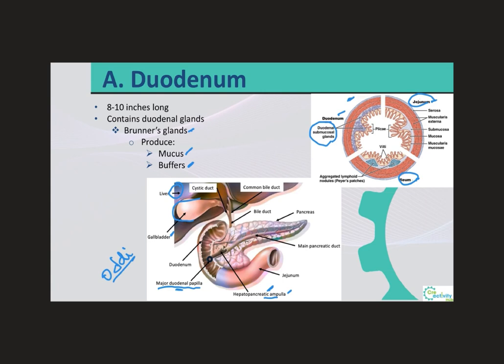And why is this? Why is it that these mucus glands are more abundant in the proximal portion of the duodenum? Well, remember that buffers and enzymes from the pancreas and bile from the liver enter the duodenum roughly halfway along its length. Therefore, the buffers from the pancreas will help to neutralize the pH right in the middle of the duodenum, once the pancreatic juice enters through the major duodenal papilla, also called the sphincter of Oddi. So there's no need for you to have large quantities of these glands once you pass this sphincter.